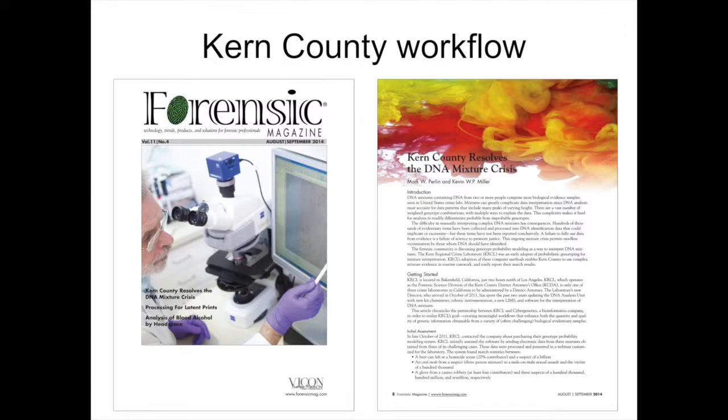They've got requests automatically set up. And what they're doing is they're setting things for 5,000 cycles with the MCMC. And they are screening all of their data before they ever see it. So they can set something up before you leave work the one day, you come in the next day and you've got your match results before you've ever had to do anything. Much more efficient than spending hours looking at data before you can start to compare it to anything.